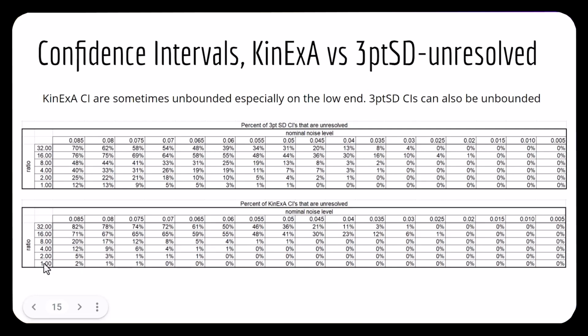Now, this is a KD-controlled curve, and even in noisy data, I do expect to resolve quite a few of them, perhaps fairly broadly, but I expect to resolve them. KinExA says, yeah, you've resolved 98%. The 3-point standard deviation is 88%. Which one's right? That's an interpretation, but in my opinion, this is better. So I'm more comfortable with this.